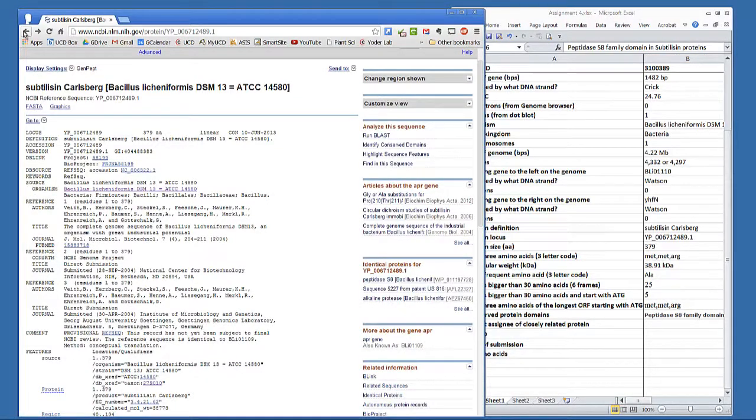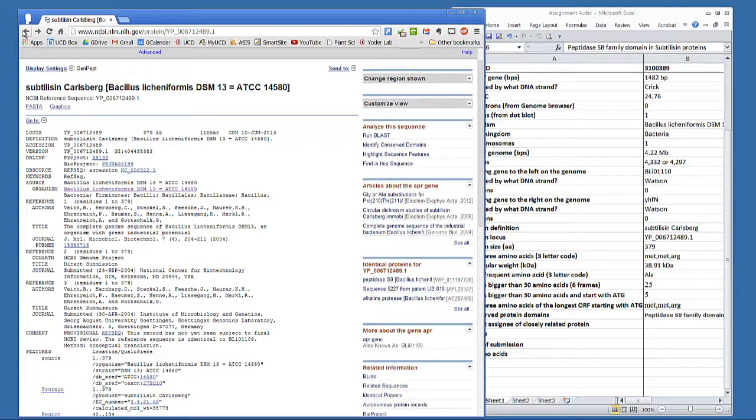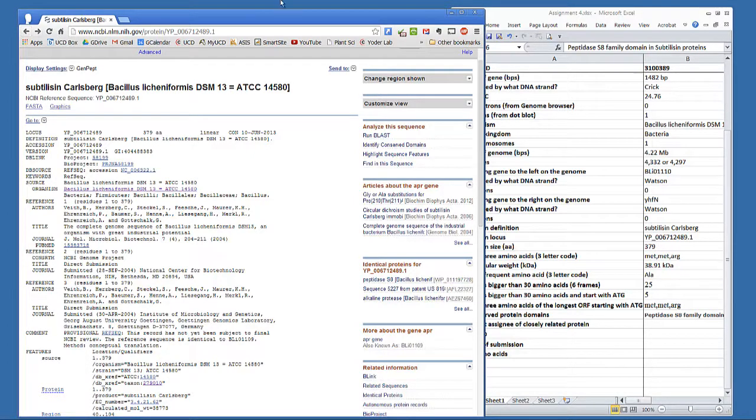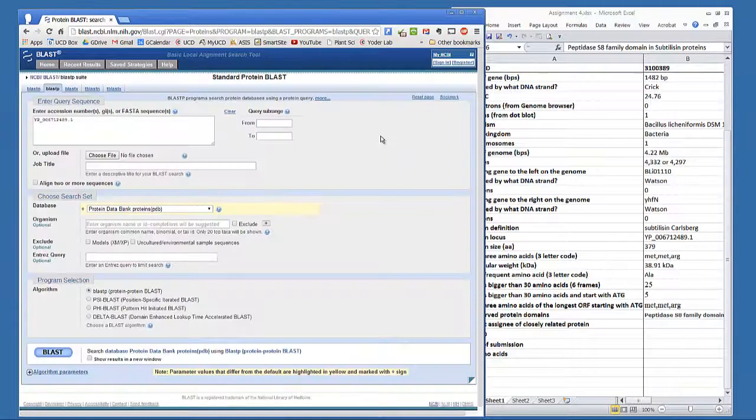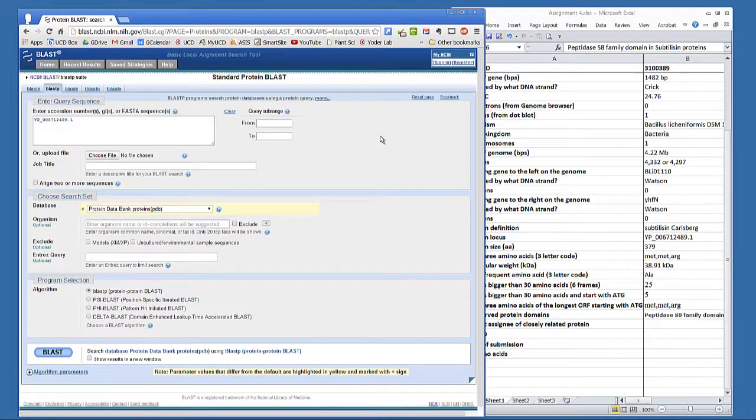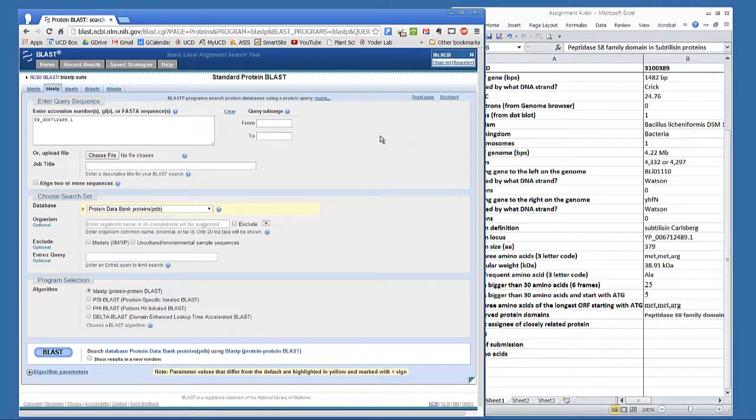Last week, you used BLASTX to find protein sequences that were coded by DNA sequences. This week, you're going to use BLASTP to find related protein sequences. You can run BLAST programs directly from the protein page by clicking the Run BLAST. The accession number containing the sequence is already entered into the search box. All you need to do is tell it what database to search.